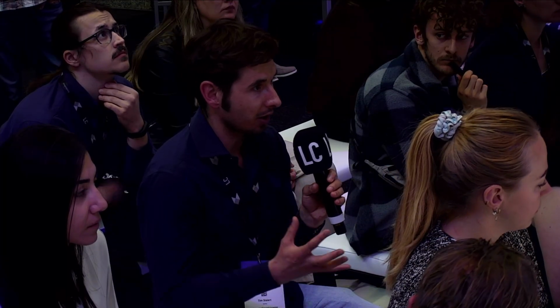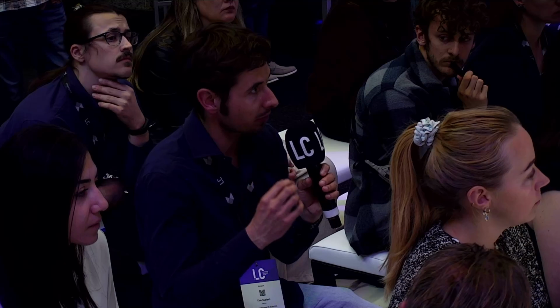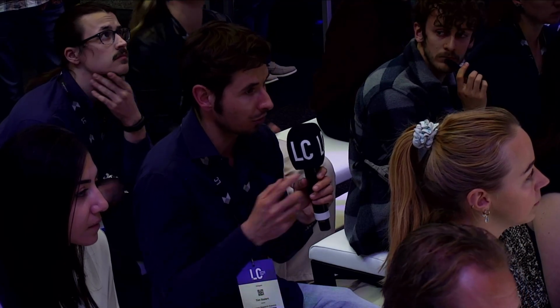Sorry, just the total amount of yield. How much gigabases? Is there a difference between adaptive sampling versus whole genome sequencing, in total gigabases output per flow cell? Yeah, I'm going to ballpark and say you get about half when you're just targeting certain regions. So we might get 100, 120 gigs doing whole genome, and we'll get 50 or 60 gigs doing adaptive sampling.